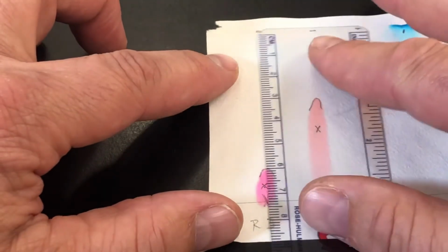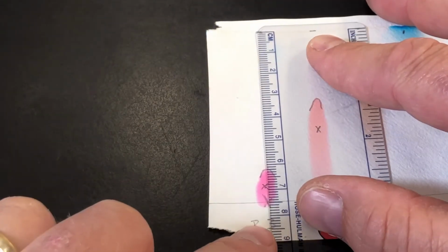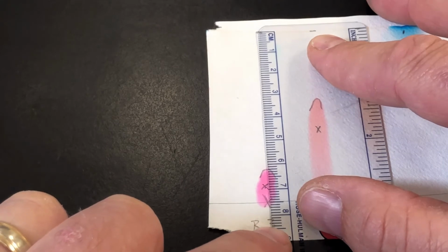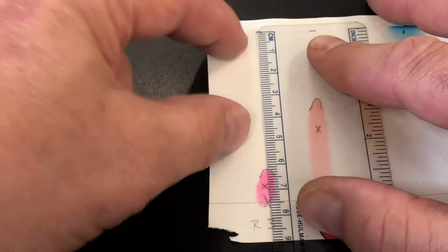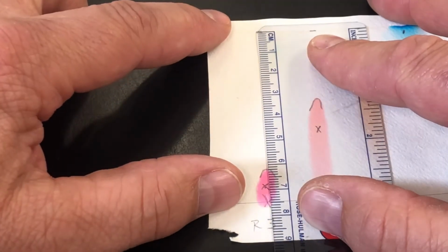We want to measure just how far the solvent traveled. So I'm getting probably a 7.50 centimeters for the distance of the solvent.